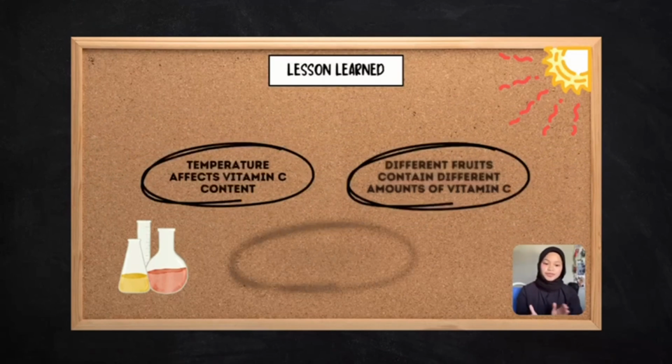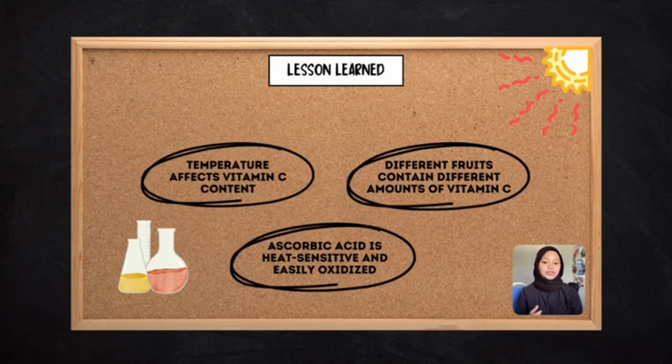In this experiment, we learned that temperature affects vitamin C content, different fruits contain different amounts of vitamin C, and ascorbic acid is heat sensitive and easily oxidized.